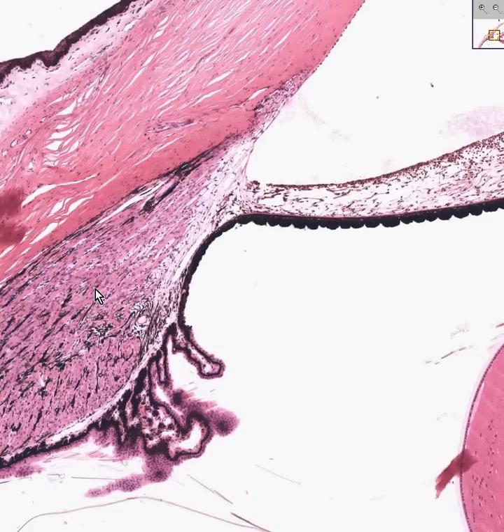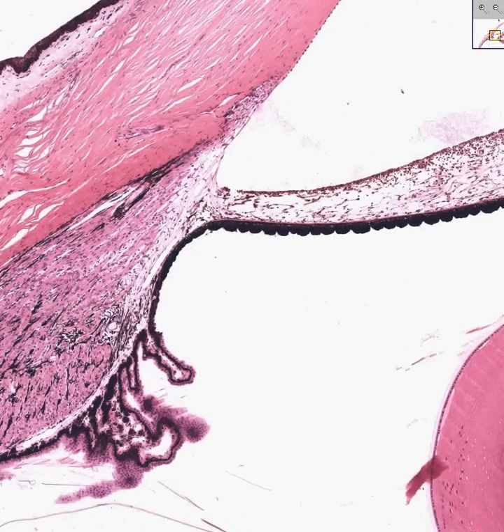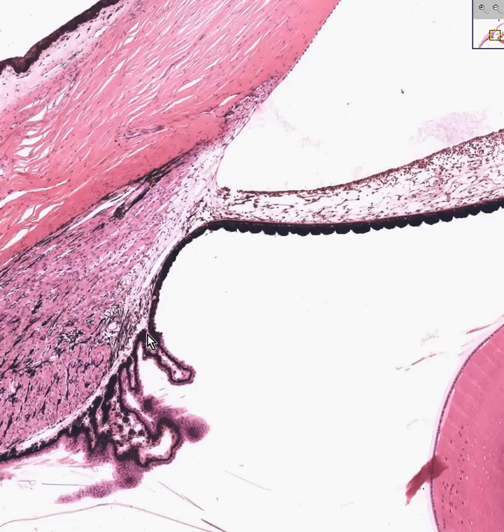Notice that there is this layer of epithelium, which extends all the way from the retina coming up through the ciliary body, all the way to the posterior portion of the iris. And this is called RPE for retinal pigmented epithelium.